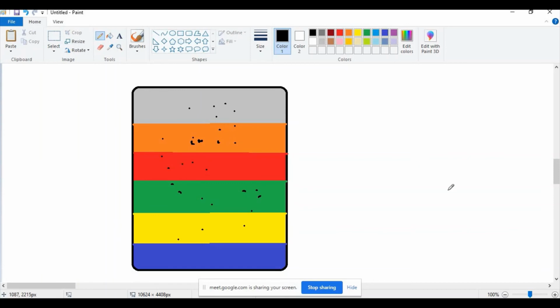Now when you start the centrifugation, these particles will start moving towards this direction. Now you see what will happen to these viral particles. Let me draw it in another simple way.